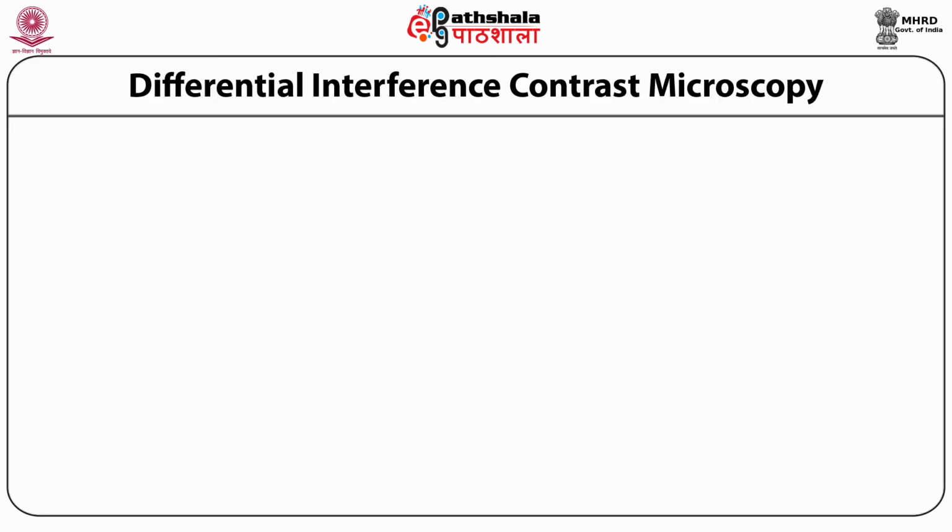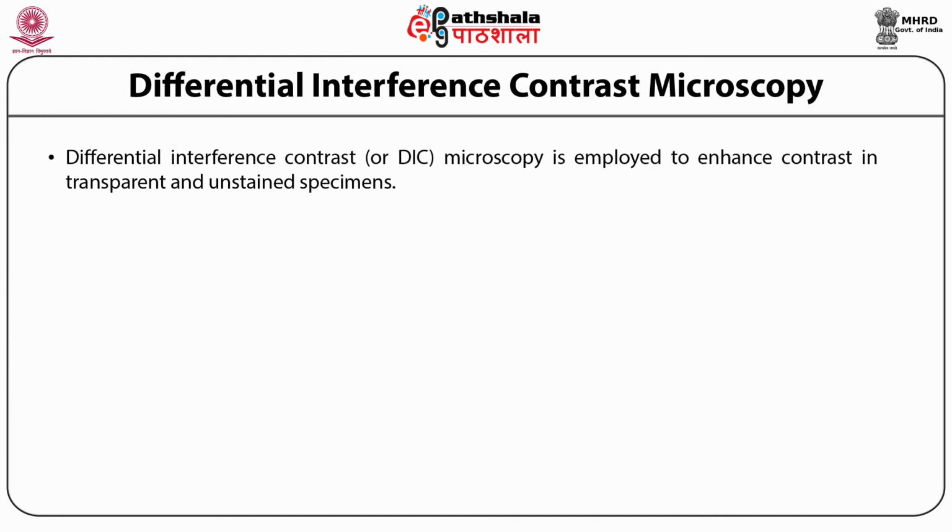Now students, let us study about differential interference contrast microscopy. Differential interference contrast, or DIC, microscopy is employed to enhance contrast in transparent and unstained specimens.